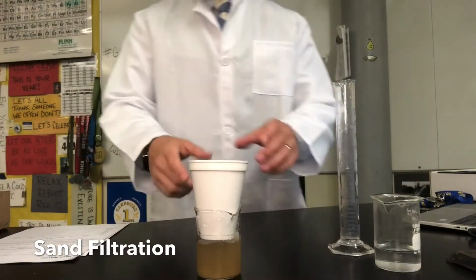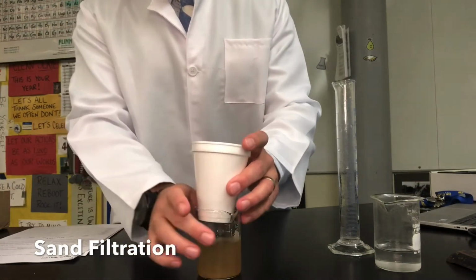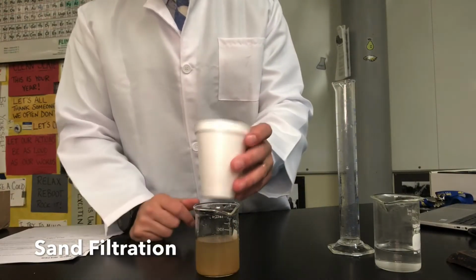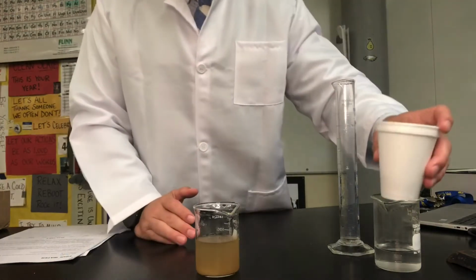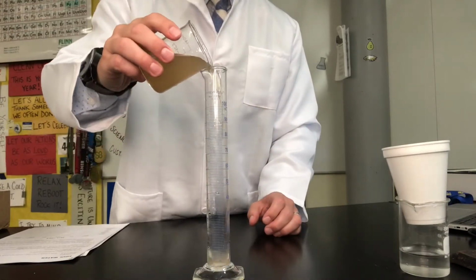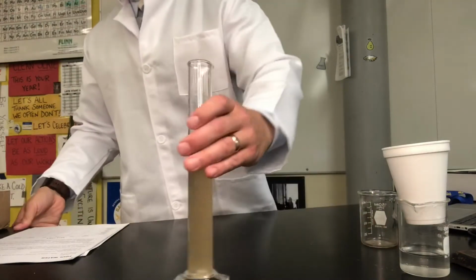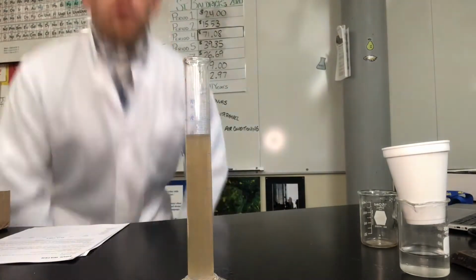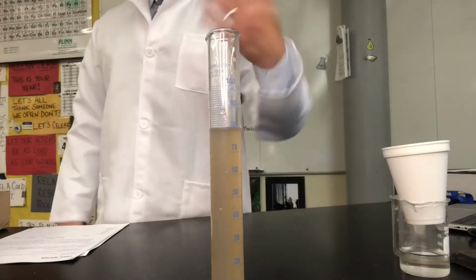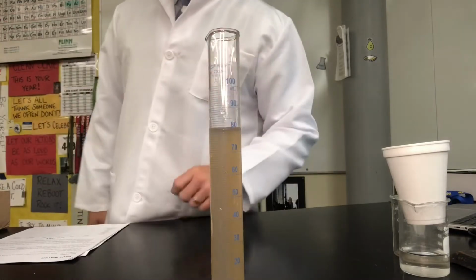And we are back, and as you can see, our sand and gravel filtration has let out all of our liquid water to the bottom, but all these little chunks that we had earlier, you'll see are missing. So I'm going to move this over to here, and let's measure out how much water we actually have left. So we're going to fill up our graduated cylinder, and when we measure our graduated cylinder, we always want to read it at eye level. And we are now at 80 milliliters. So we went down a few milliliters, which is natural. When we physically separate things out, we're going to take away some of the volume. But now after the sand filtration, the volume is 80 milliliters.